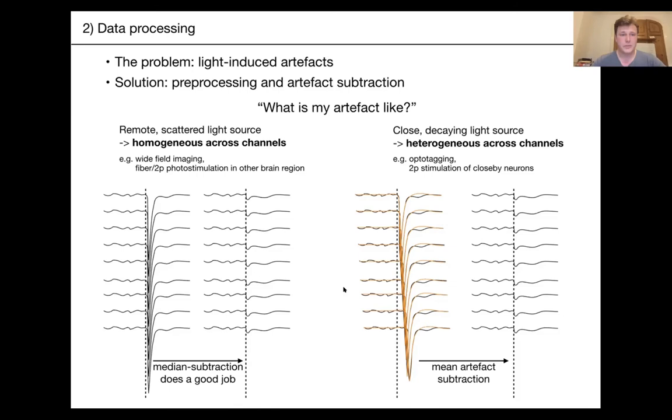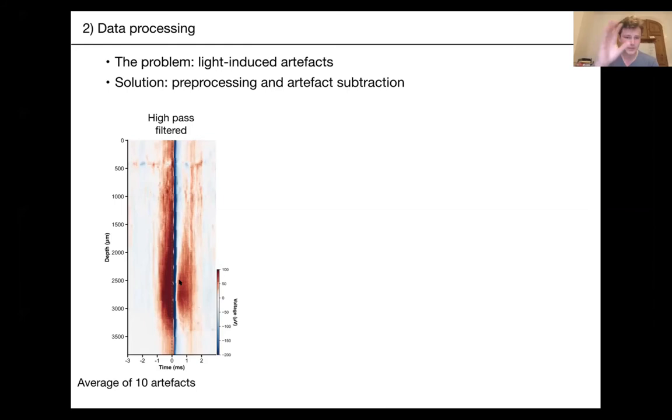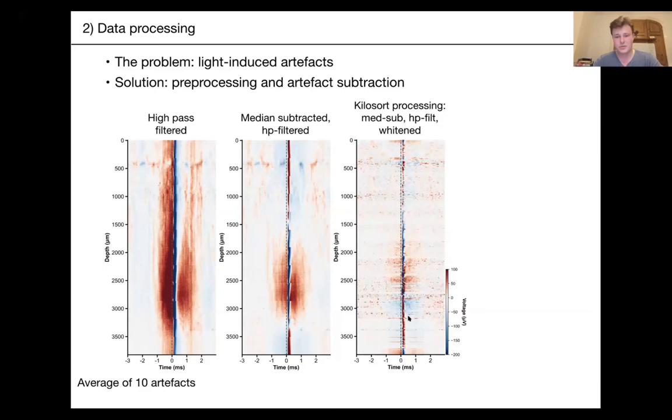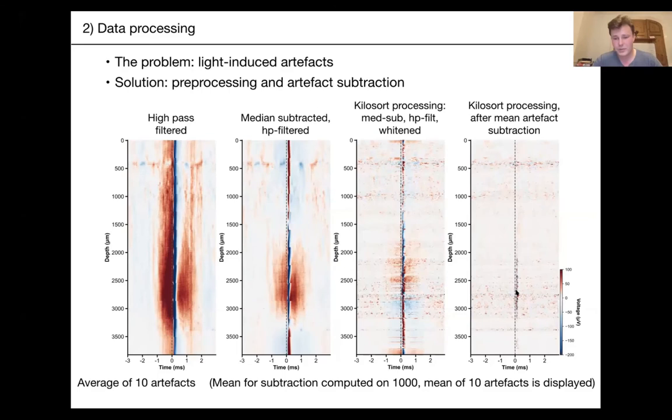Here's an actual example of this procedure. Starting with high-pass filtered data shown as a color map — positive voltages in red, negative in blue — you see the negative artifacts at optostimulation onset in blue, and ringing artifacts on both sides in red due to filtering. If you simply median subtract, some artifacts are removed but others flip from negative to positive or remain. Adding whitening, as Kilosort does, improves things a bit. But you still have remaining artifacts, so you compute the mean artifact and subtract it — it's never perfect because there's variability across trials, but you get something slightly better.